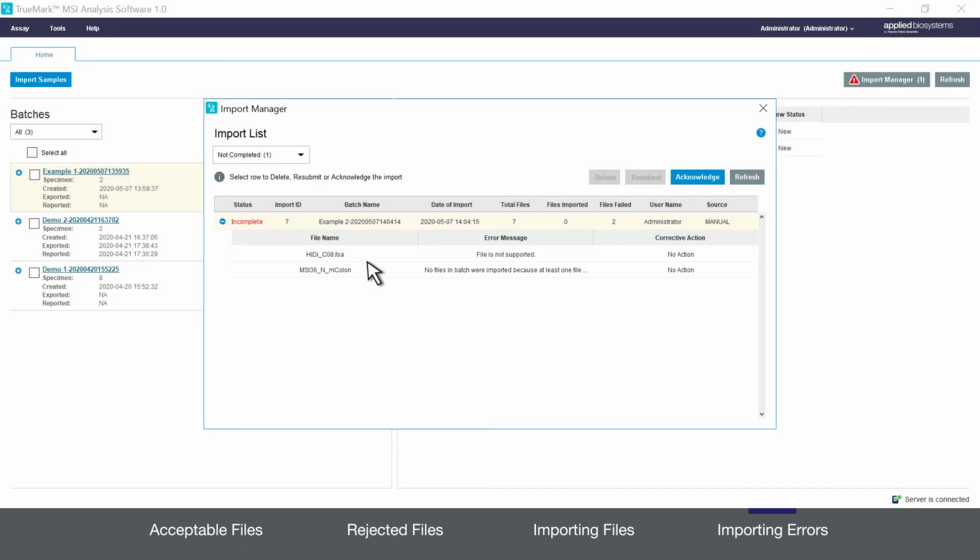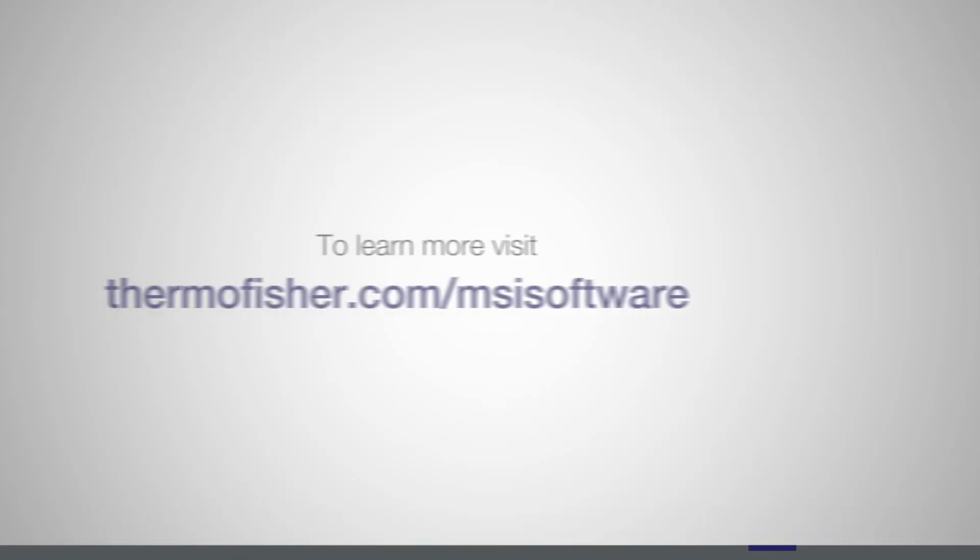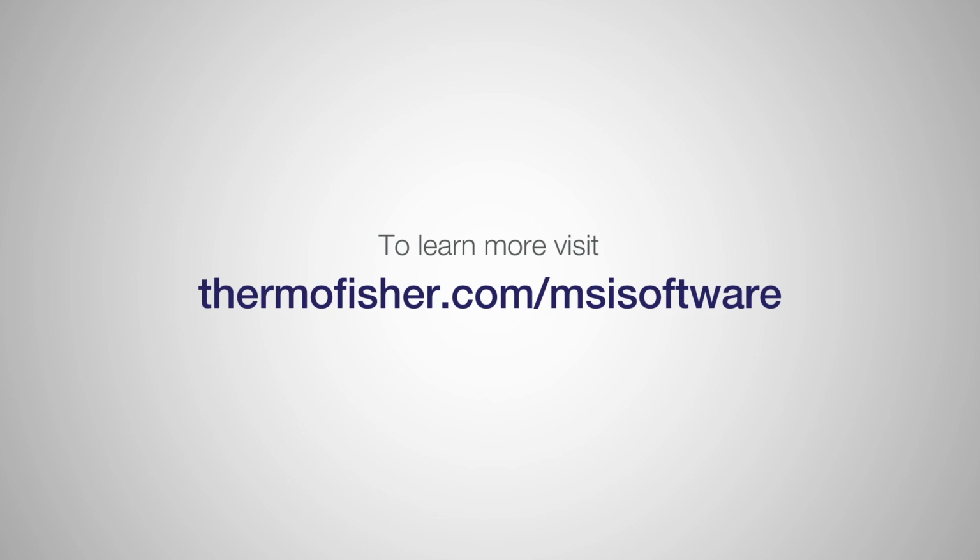Once you've identified the cause of the error, click Acknowledge, which will clear the error from your Import Manager. And that concludes our video. There's even more to learn, so make sure to check out our other videos in this series about the TrueMark MSI Analysis Software.